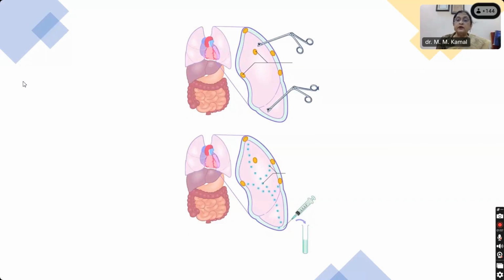But targeting the nodule, which is very nicely shown in this slide, is slightly difficult and you may miss the target and may not get sufficient material. So what is more convenient? If along with the nodule there is accumulation of fluid in the body's cavity space, you can collect the fluid and study the fluid. This is what the slide is telling us.